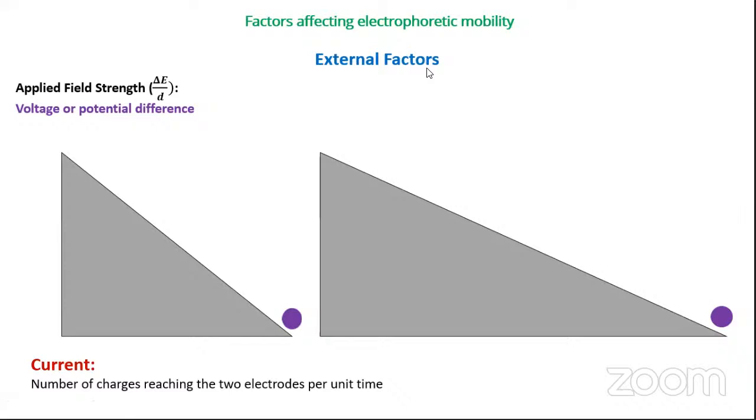Directly proportional. Yes, they are directly proportional to each other. So what it means is that when I increase the voltage, there will be increase in current, correct? Yes. But is there any other parameter that can affect this direct relationship, according to you?